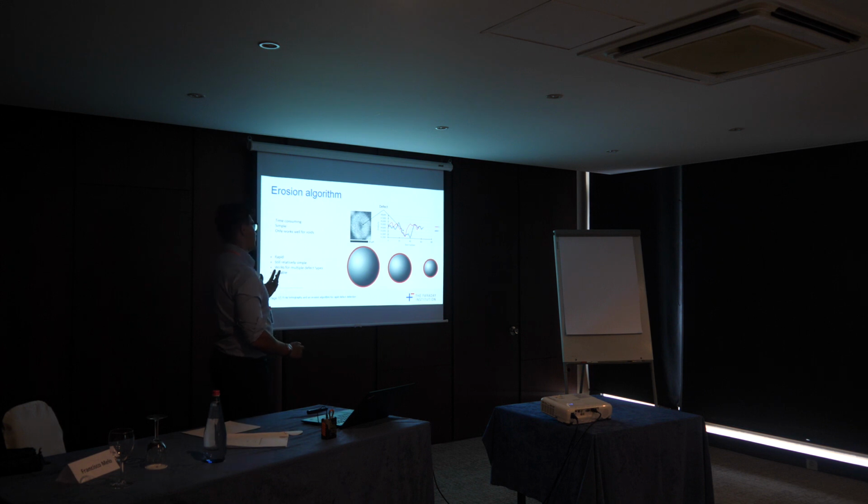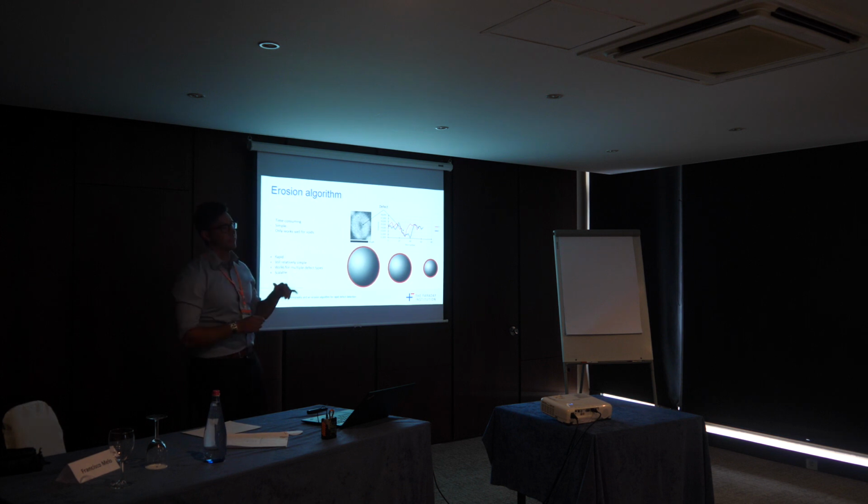So the first thing we thought to do was to look at our particles, pick them out by hand, and look at the intensity through them. If you look at the two lines on the right, this is their intensity. You can see in the middle where there's a void, this intensity drops. So we can infer that if there's a drop in intensity somewhere, there's either a void or a crack. Doing this by hand is really time consuming and not very productive.